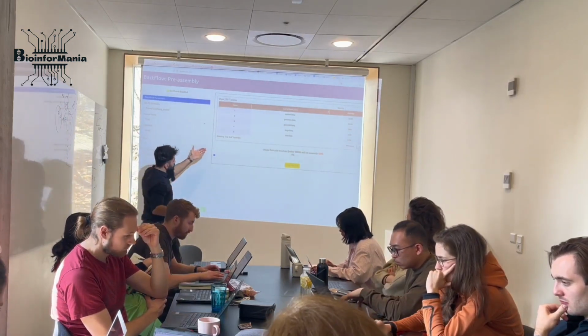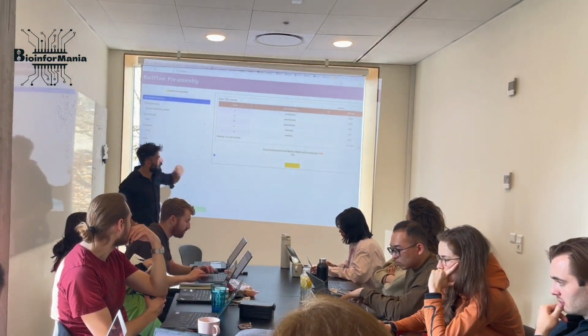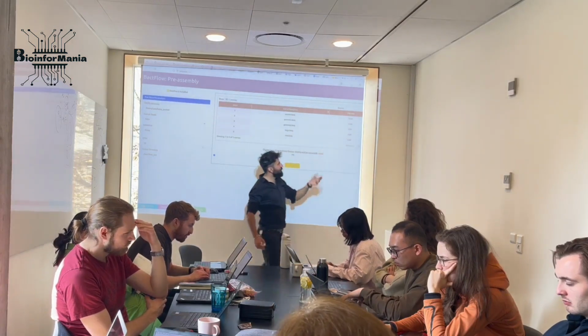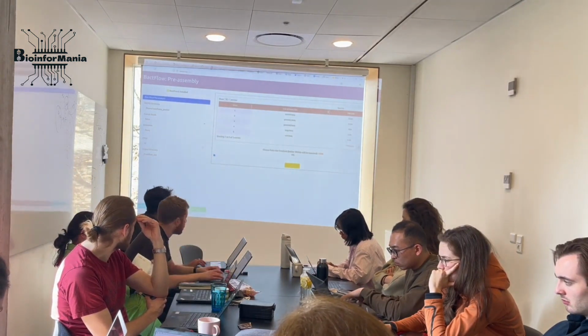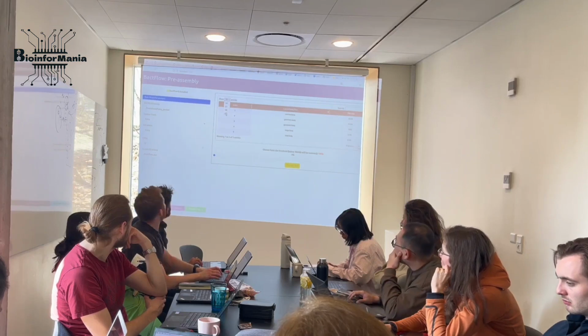So it gives you a list of your genomes. Each fastq is one genome, okay? And then here it gives you the size of them: 213 megabytes for one and 1.3 gigabytes for another. And then what we have here, let me pull up the whole entry.